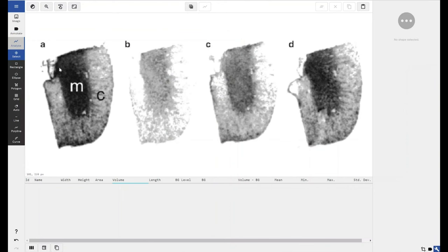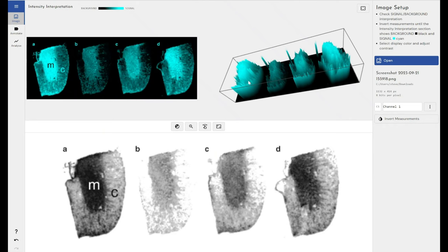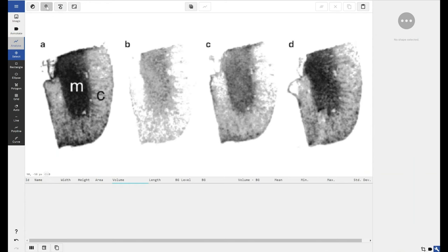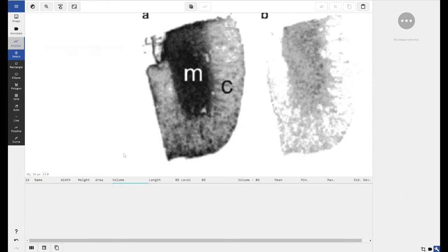Next I'll come through to the Analyse section — this is where we're going to start taking measurements from the image and defining areas of background. Because I took this image from a paper, the image quality is not great. I don't have access to the original TIFF image. I'm relying on a screenshot, so the feature quality is not great. If I come back to the image tab, I can see it's an 8-bit image. And if I zoom in, I'm sure it will become very pixelated — yes. This image is still great as an example because I've only really got two sections I need to consider.